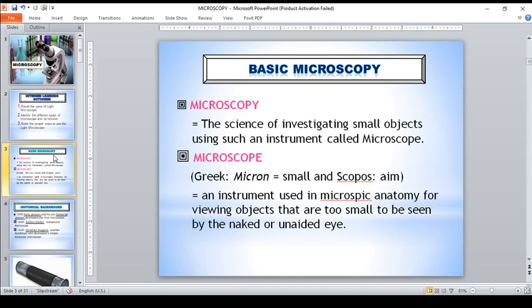What I mean by definitive diagnosis is that if the gram stain result shows bacteria, it doesn't mean that they are already pathogenic. Because definitely, guys, the urine has a lot of bacteria, but a good medical technologist would be able to identify if those bacteria are pathogenic or not using laboratory methods, not only the gram staining, including the culture and sensitivity.